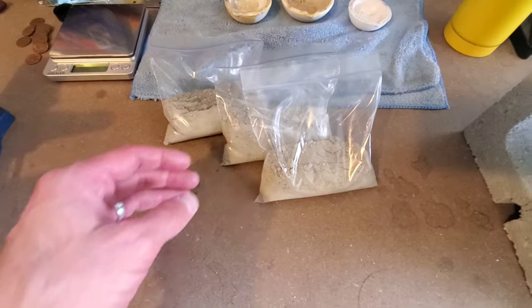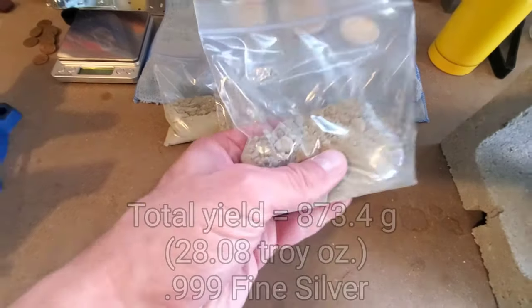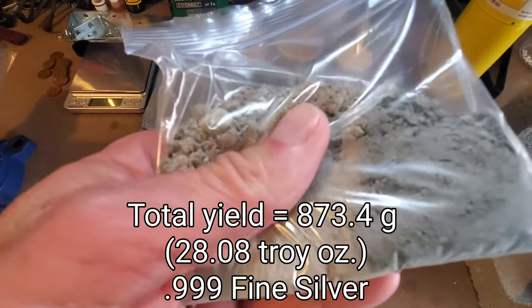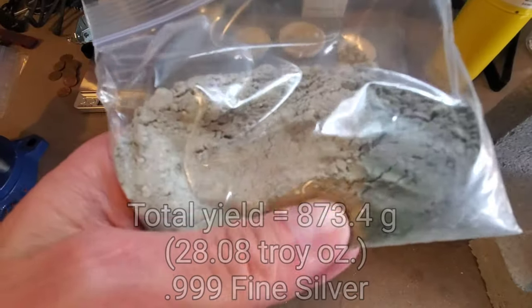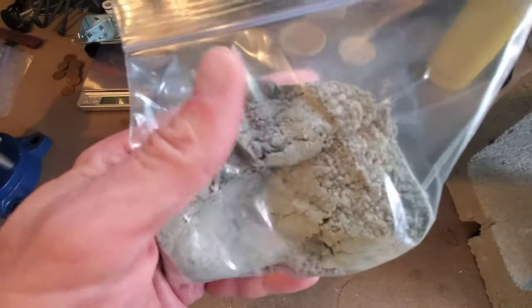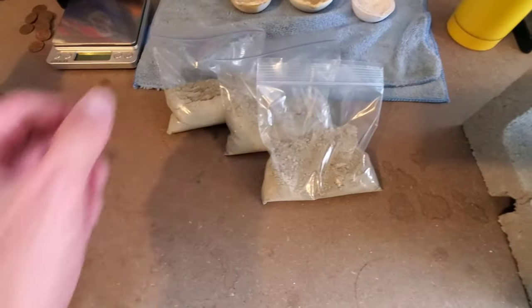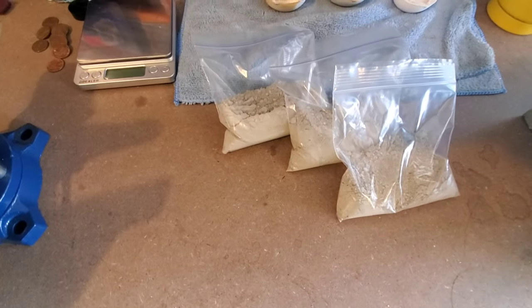All right, after the drying process, we're left with this fine silver cement or powder, which is 0.999 fine silver. The next step is going to be to melt this down into silver shot, making it easier to pour into some molds.